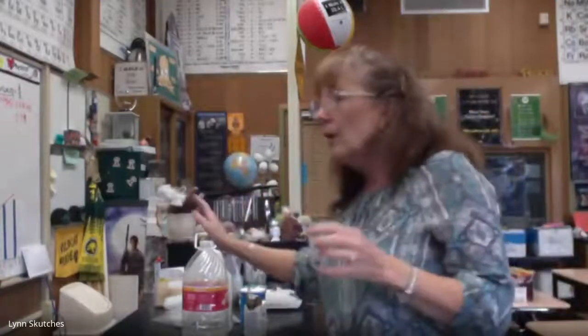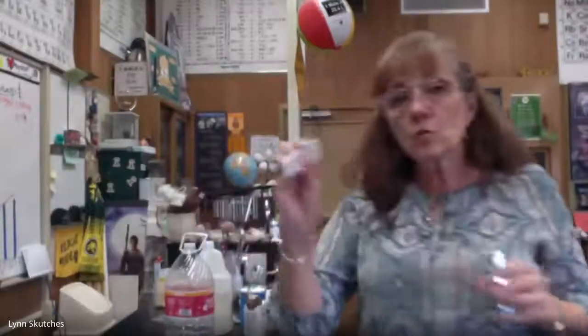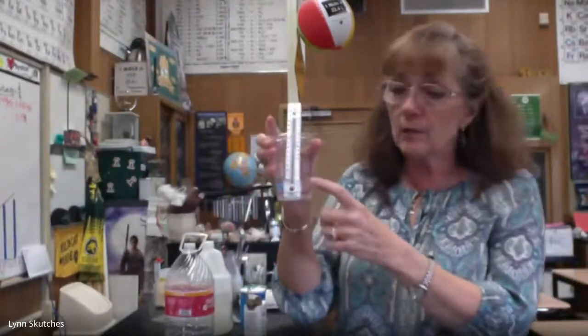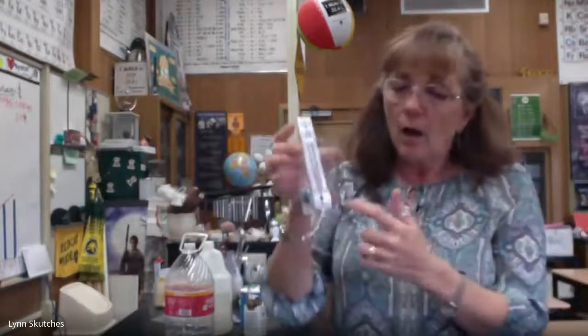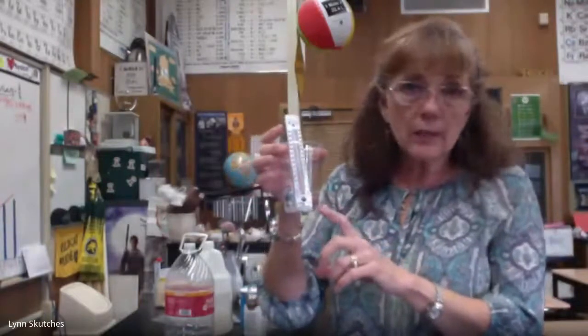All right, so what are you doing? You're going to use your little cup. And I have a jug of water. You don't have to have a jug, just tap water is fine. You're going to take that and pour 50 milliliters or so into your cup. You're going to use your thermometer and get the temperature. You need to make sure that the bulb of the thermometer is below the liquid surface completely. You need to leave it in here for a couple of minutes. Obviously, water should be clear and colorless. So you just need to let it sit and equilibrate for 2 to 3 minutes.